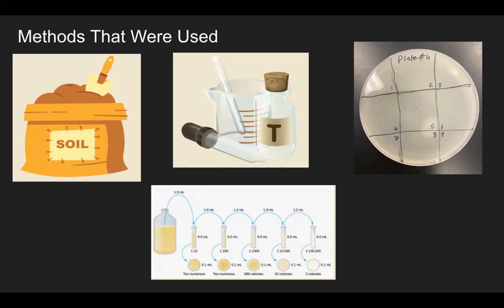These plaques are formed by bacteriophages injecting their DNA into Mycobacterium, which replicates the phages to create phage proteins, which are then assembled into phage particles, which then cause host lysis. These dead bacteria cause clear plaques in bacterial growth.